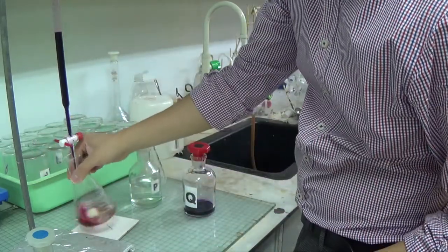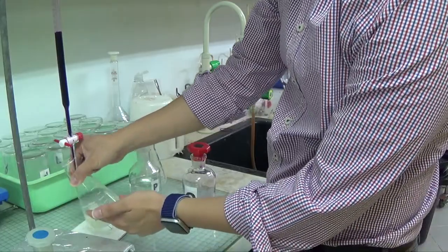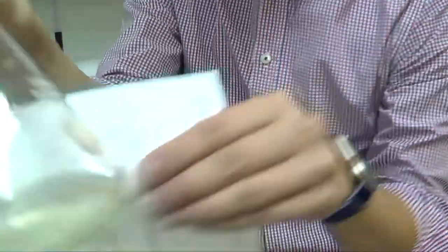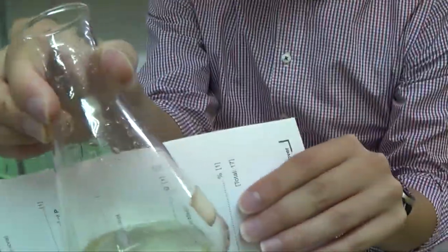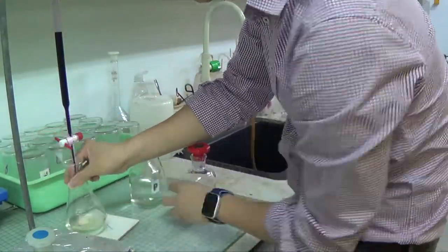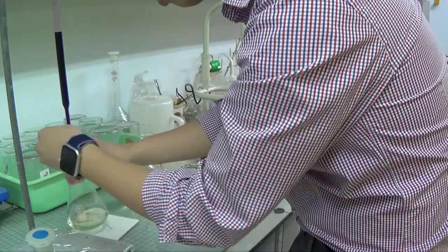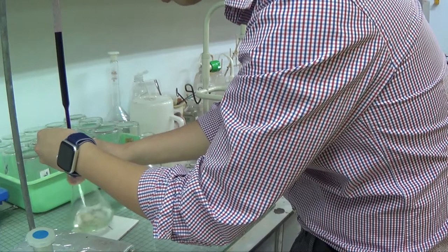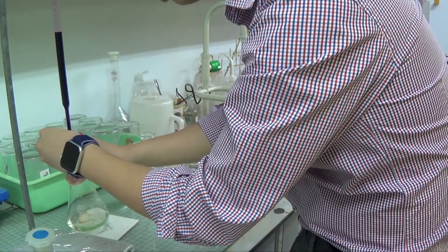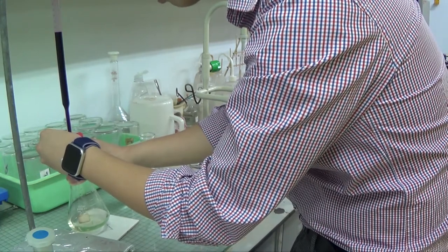Okay, so I hope you can see that it is still clear. It is still this pale green color. It is not the pink color. All right, so we'll do it drop by drop from now. Drop by drop, hands on the valve, another hand on the conical flask, swirling. Now you have to swirl continuously and do it drop by drop, and your eye level is on the conical flask, never on the burette, on the conical flask.